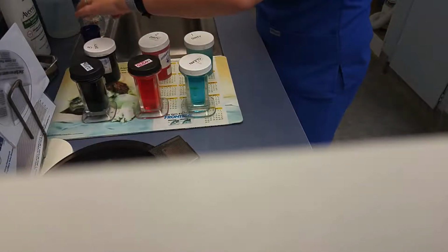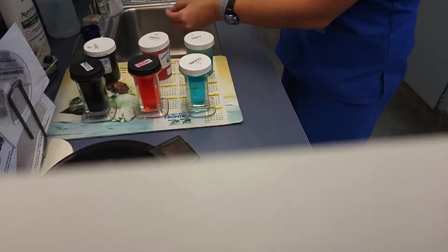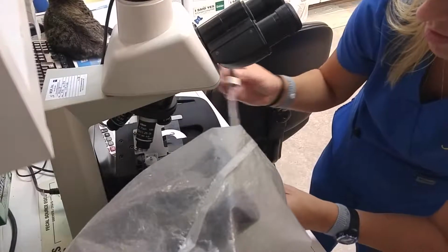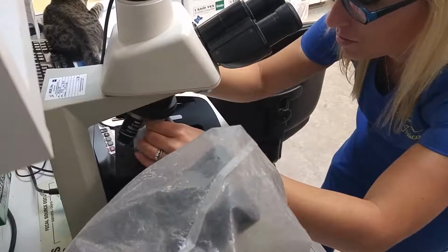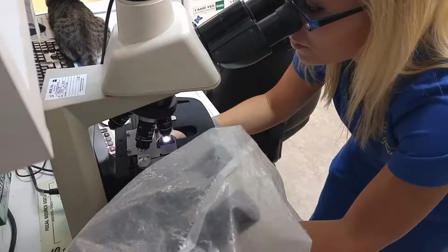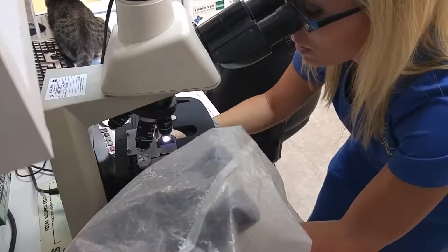Lights it off. And the water here. Just a little bit, so we're gonna go ahead and dry it off, and then we'll look at it under the microscope. Alright, it's nice and dry, so we're gonna go ahead and take some oil. Just put a drop on there. Down to the immersion oil, the 100 lens to make sure that we can get as close as we can.